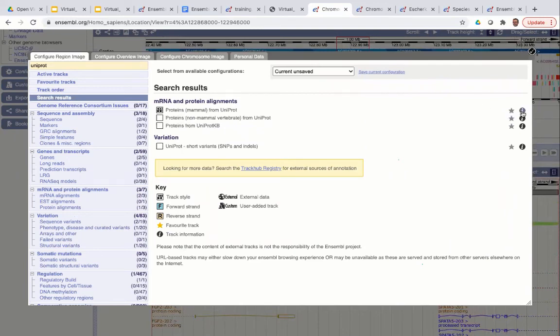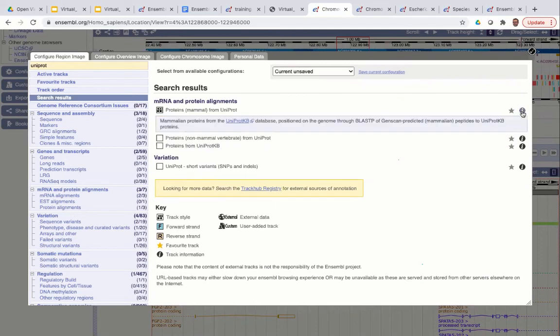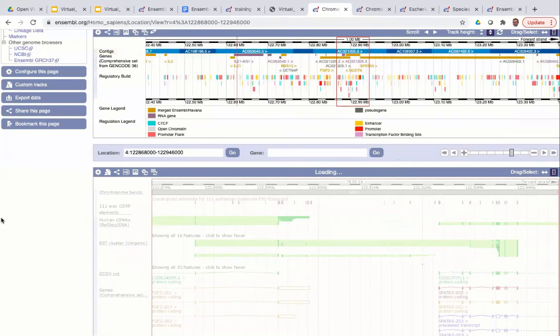If you're not sure what a track will show you, click the information icon for a longer description of what you'll see when that track is turned on. When you're happy with your selections, save and close using the tick in the top right corner of the pop-up window. The image then reloads with those new tracks added.